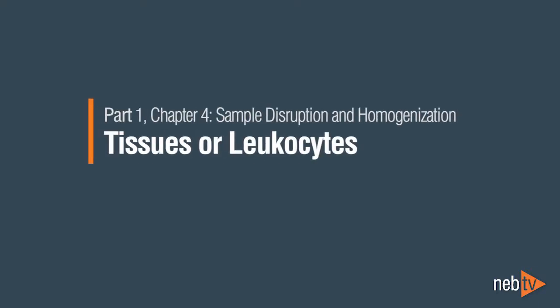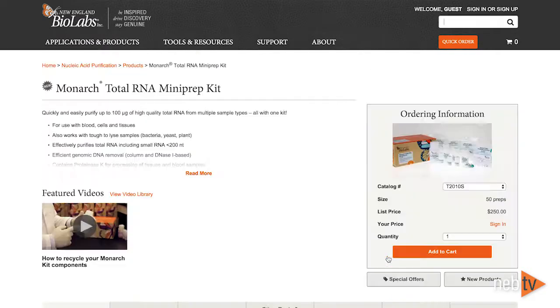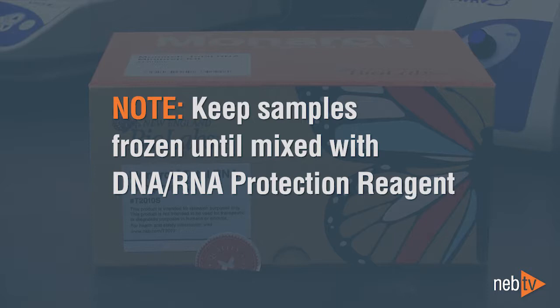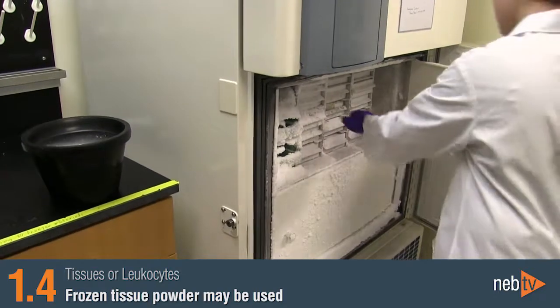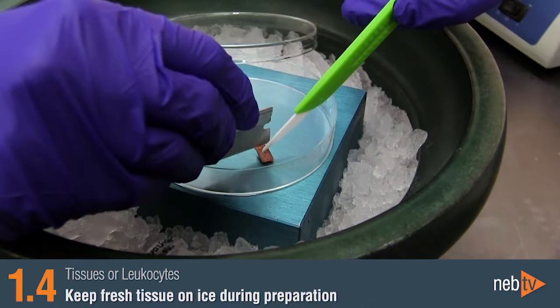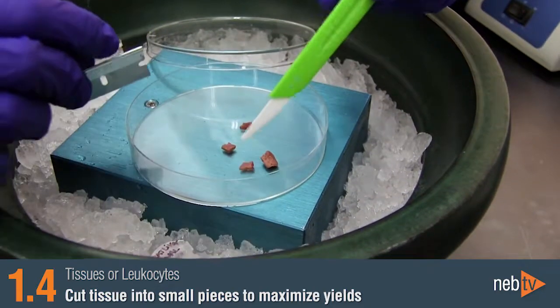Part 1: Sample Disruption and Homogenization for Tissues or Leukocytes. Before beginning, it is important to refer to the product manual or our website to find out the recommended amount of starting material. Using more than the recommended amounts will affect your yield and purity. For frozen samples not stabilized in DNA-RNA protection reagent, ensure that the frozen material remains frozen until your samples are mixed with the protection reagent. Fresh tissue materials should be kept on ice during preparation, and make sure that tissue is cut into small pieces to ensure rapid lysis and high yields.